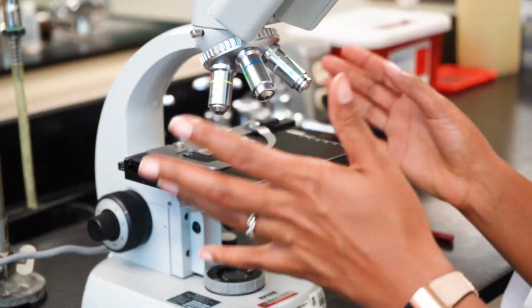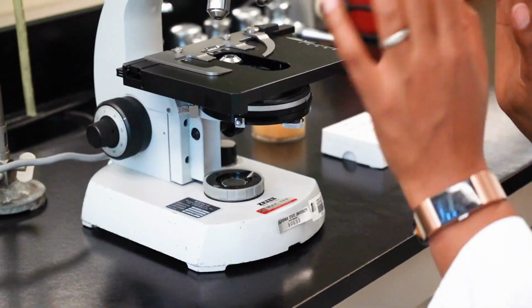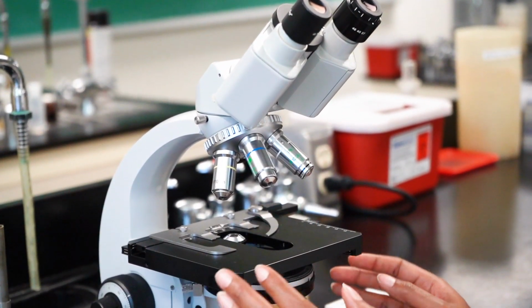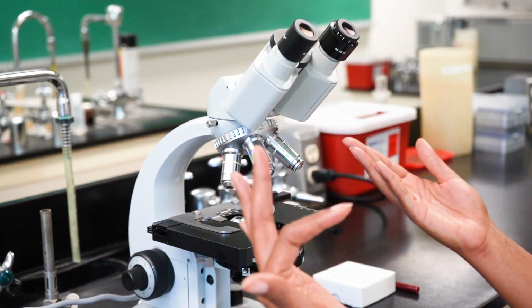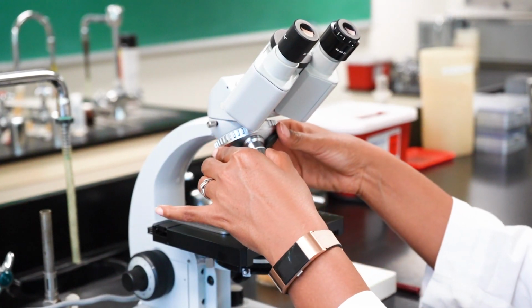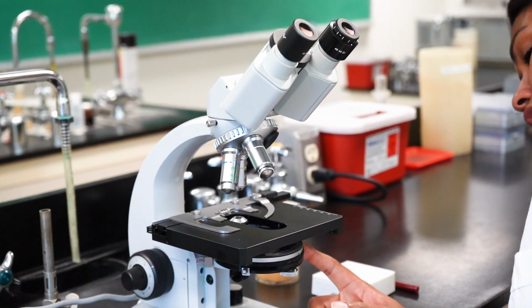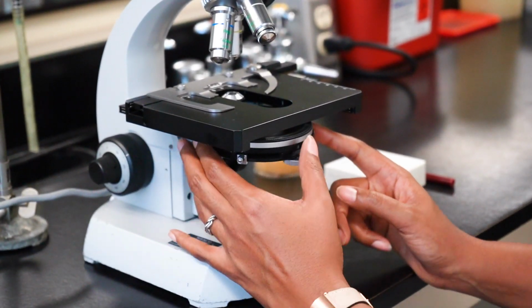First thing we're going to do is prepare the microscope for use. Before you even begin to think about viewing a specimen, there should be a few things that you check. The first thing is whether or not you have an objective lens in place. If the microscope is stored properly, then there is no objective lens here, so you're going to want to turn to the 10x objective.